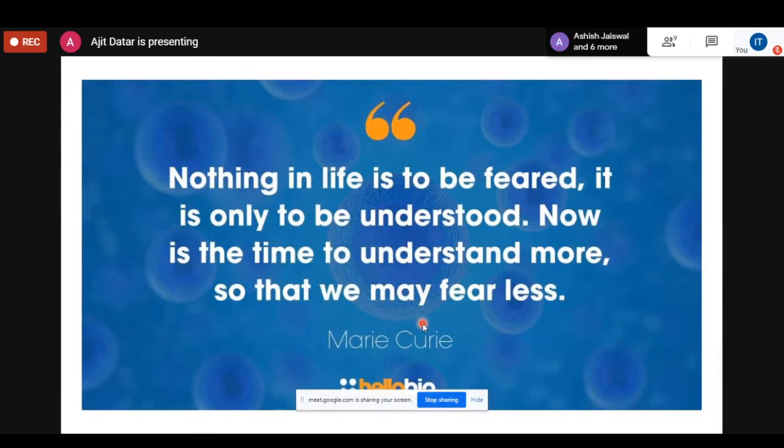Dr. Mangesh Dagawal asks, if we have only a plant powder and we want to know a specific compound from that, how do we go about it, right from basic to advanced?